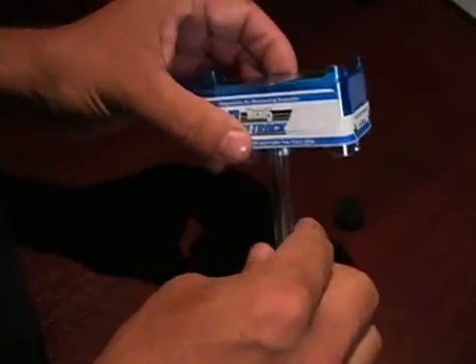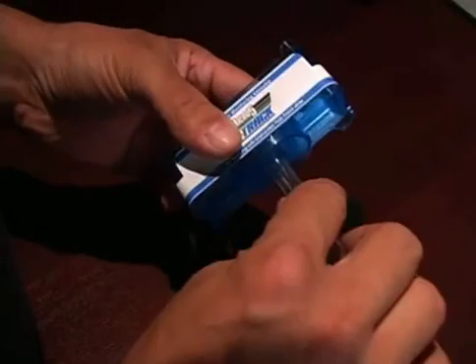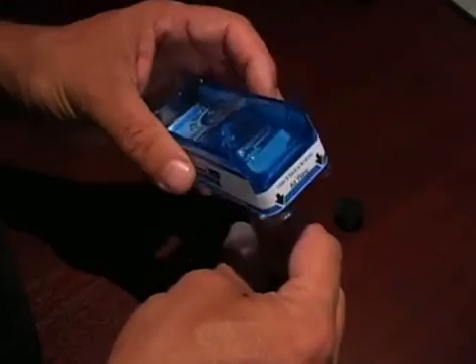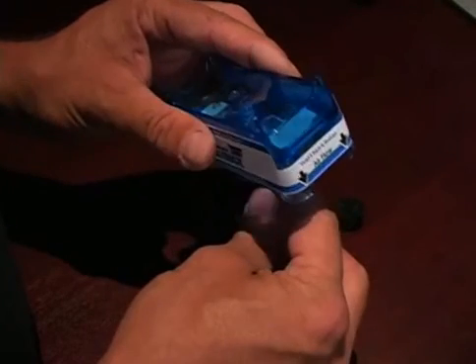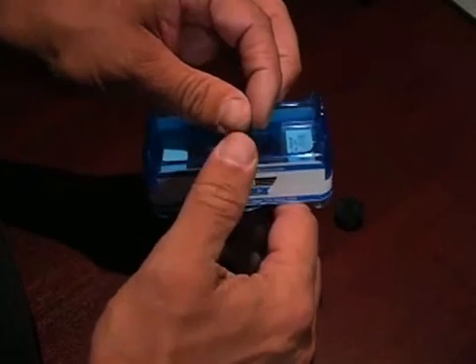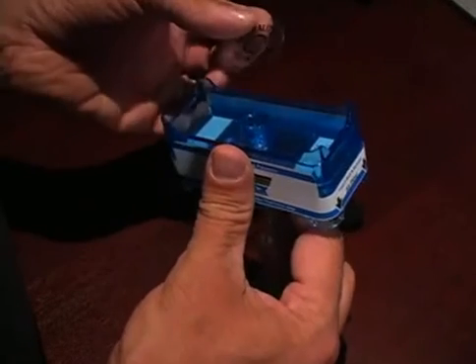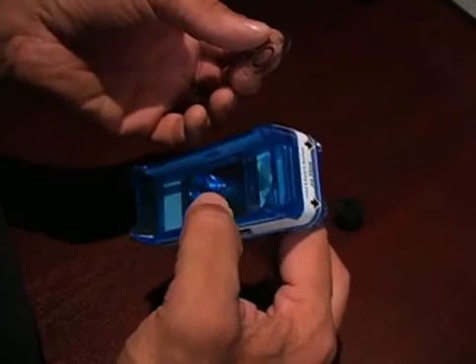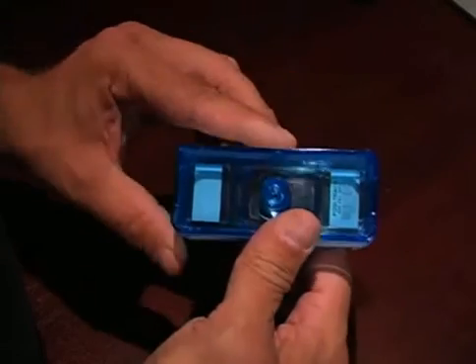You're in the area of sampling. Say you're in a room that's musty and you don't see any visible mold. So you're all set to go and turn on the unit. You peel back the quality seal and attach it temporarily to the side of the cassette during sampling. I like to attach it to the back. Air is going to go in there through the sampling unit and out to your pump source.